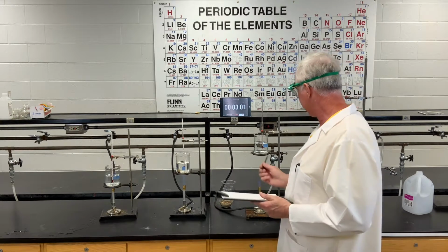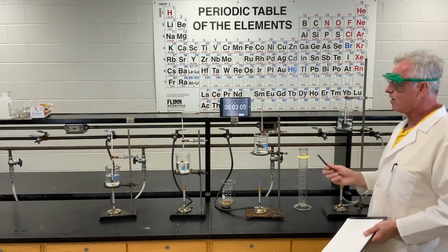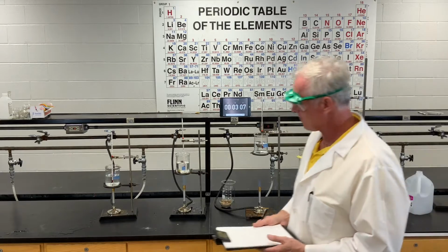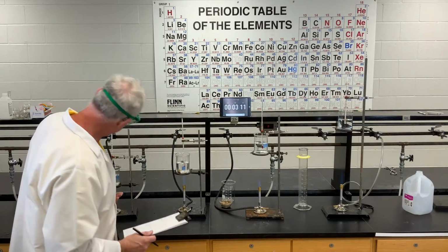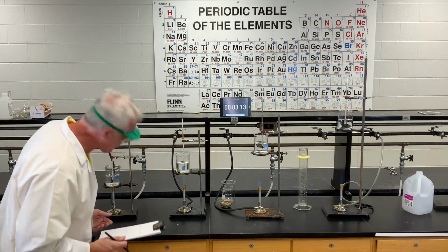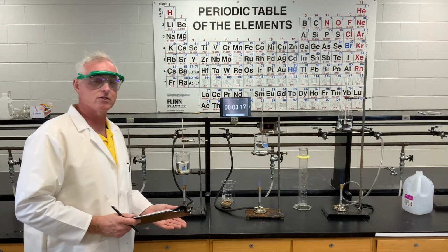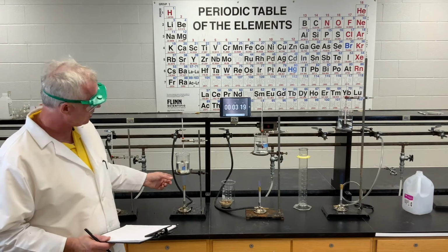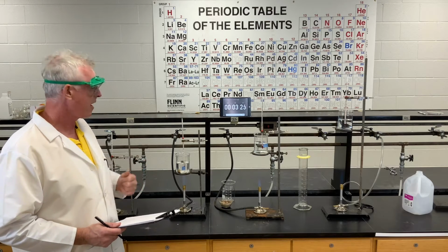So again, it's a little bit hotter than this, but really, we're only about a degree or 2 off. Now, these two, however, are doing a lot better. This one at 3 minutes is at 56 degrees, but this one is at 70 degrees. So the top of the inner cone is clearly the fastest and most efficient.